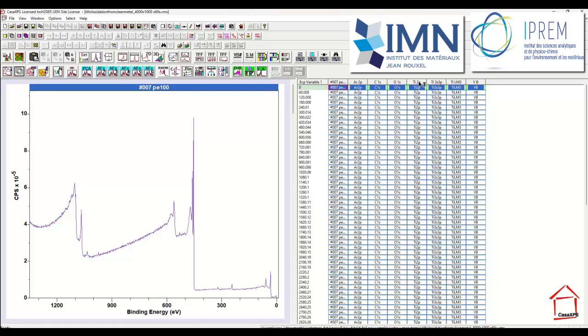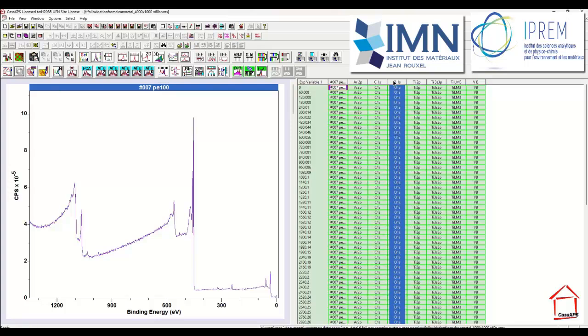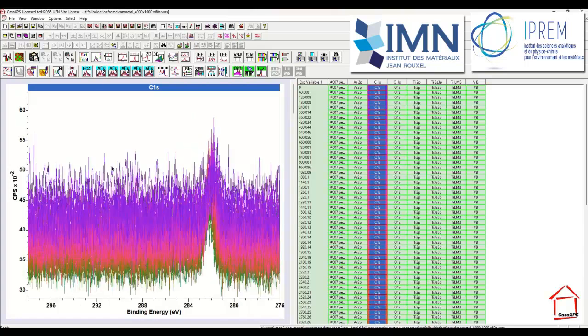And then a series of measurements are performed in which an argon cluster source with 1,000 atoms in the cluster is used to maintain the surface in a relatively clean state with respect to the carbon. The oxygen, however, continues to grow. The ion beam is not sufficiently powerful to remove the oxygen, but it does maintain a surface that does not have any hydrocarbon or CO type bonds. Only carbon that is possibly bonded with the titanium is left on the surface.